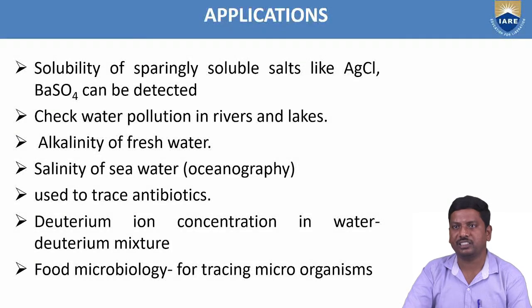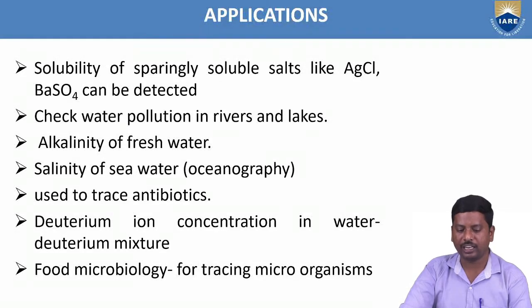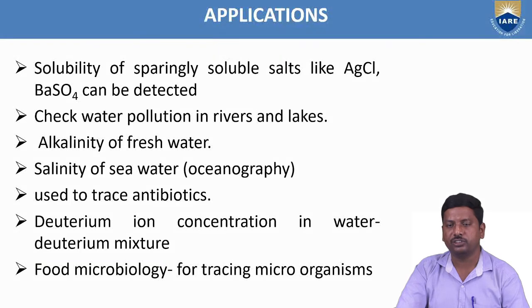And what are the applications of conductometry? It is mainly applicable to sparingly soluble salts like silver chloride and barium sulfate. Even those salts can be determined. It is also used for water pollution in rivers and lakes, alkalinity of fresh water, and salinity of sea water. That means even in oceanography, the sea water contains a high salt percentage. In those cases also we can determine the salinity of sea water by using conductometry. And trace antibiotics and deuterium concentration, even in a water-deuterium mixture.